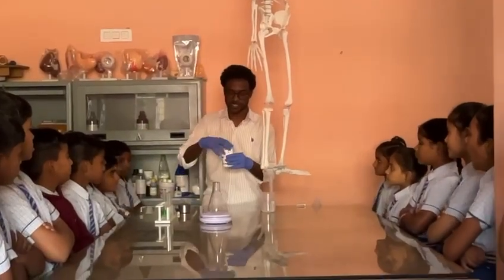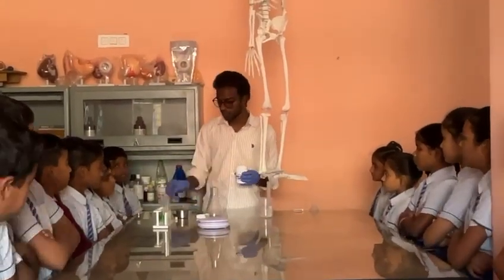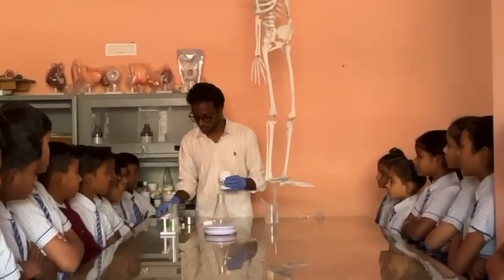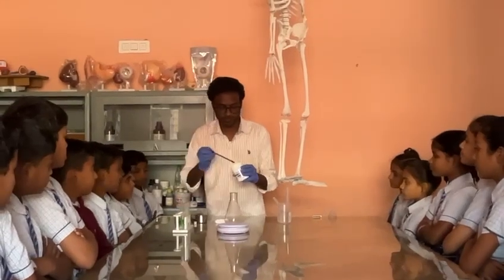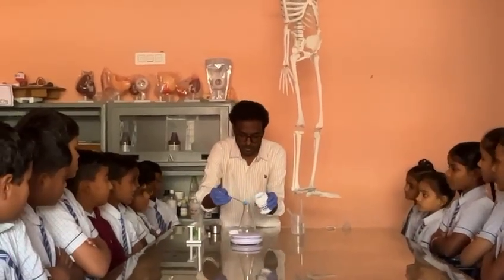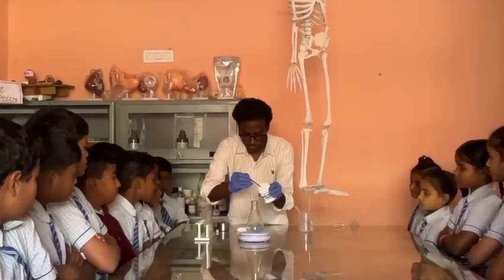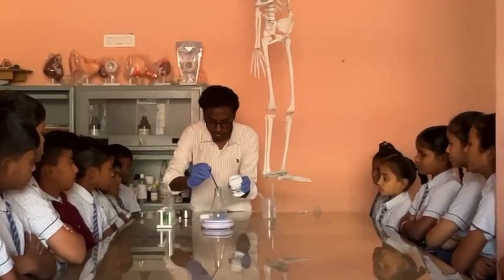At first, I am going to take a little copper sulfate with the help of the weighing machine. I am going to weigh some 10 grams of copper sulfate in the conical flask.